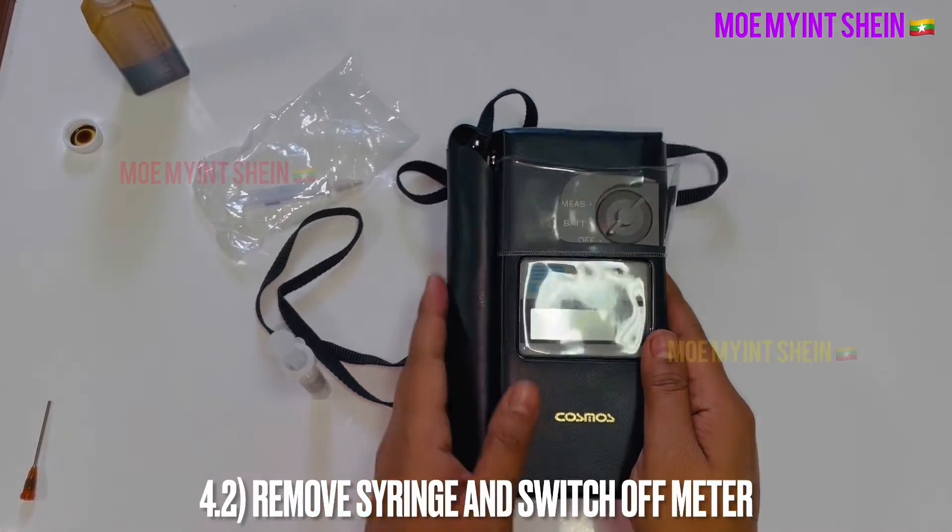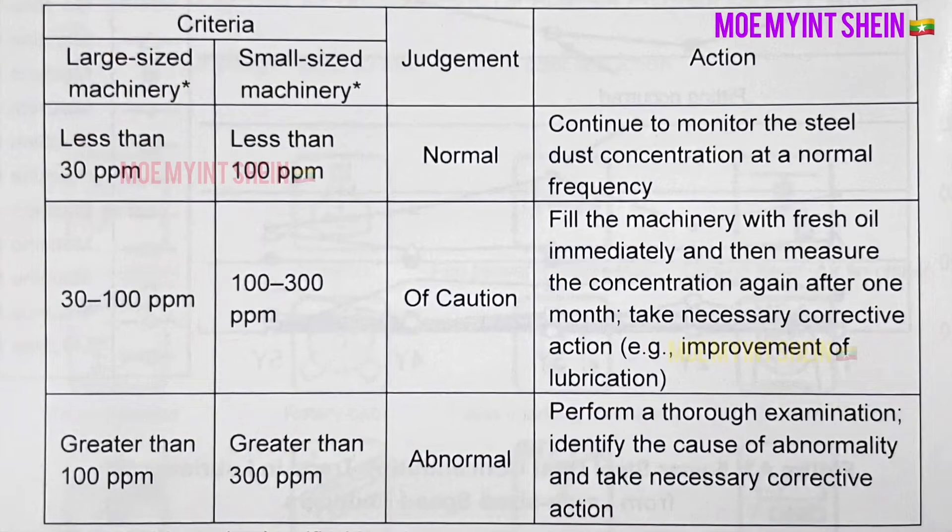Finally, remove the syringe and switch off the meter.